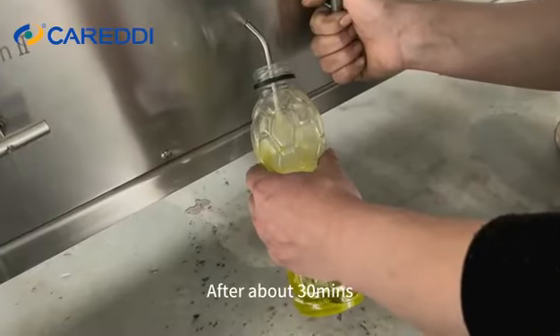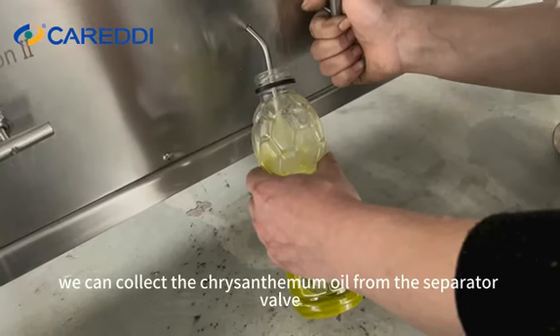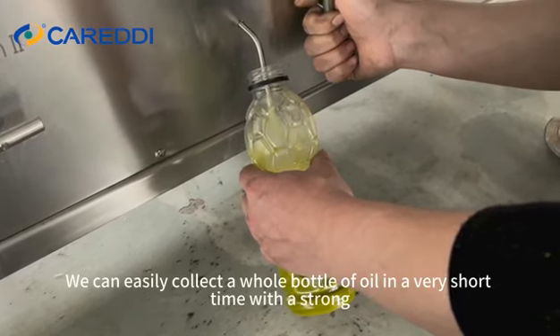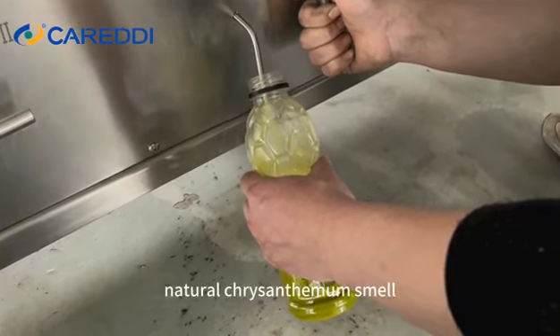After about 30 minutes, we can collect the chrysanthemum oil from the separator valve. The ethanol really helps the extraction — we can easily collect a whole bottle of oil in a very short time, with a strong natural chrysanthemum smell.